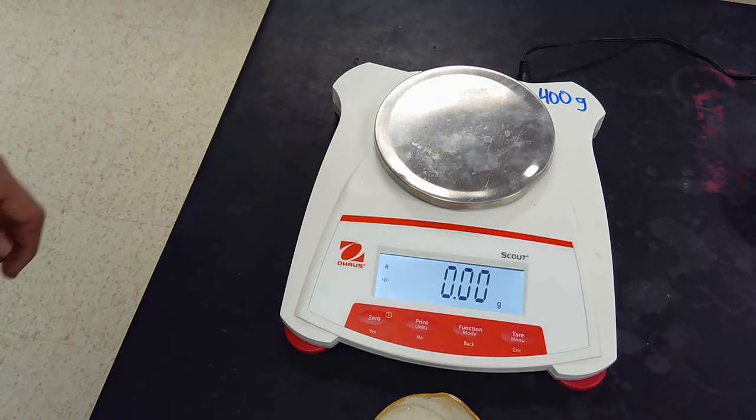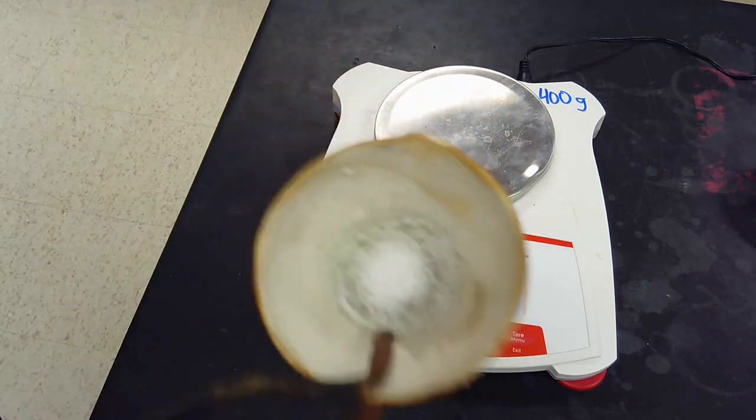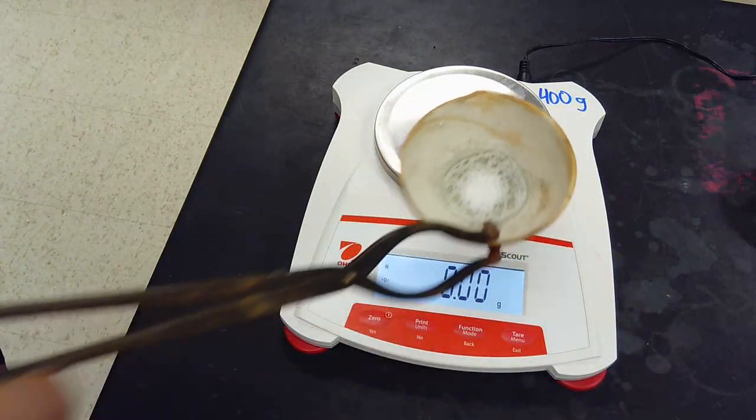After heating for only about two minutes longer, this is what we get out of it. Okay, kind of a solid structure right now — that might be good or bad. You could tell me why later.